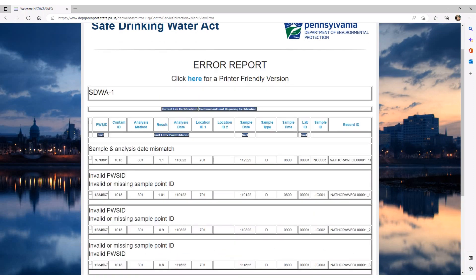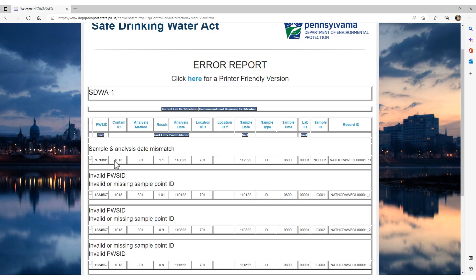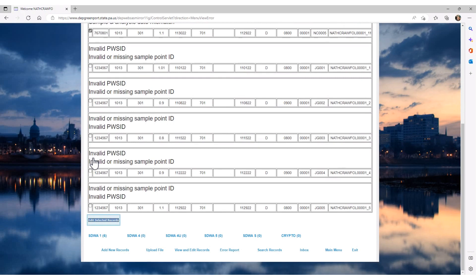The Error Report will show all of your errors or warnings for the current reporting period. You can see that there are six records for this current reporting period. Each line of data or record submitted will have its own error message or messages. For this example, we will edit the one record that was just entered that has an error. We need to find our recently entered record with the error or warning. Here we can see that the error report is telling us that this record's sample and analysis dates are mismatched. After you have identified which record you want to correct, select it by clicking the checkbox to the left of the PWS ID. After you have selected the record or records you wish to edit, scroll down to the bottom of the page and click the Edit Selected Records button.